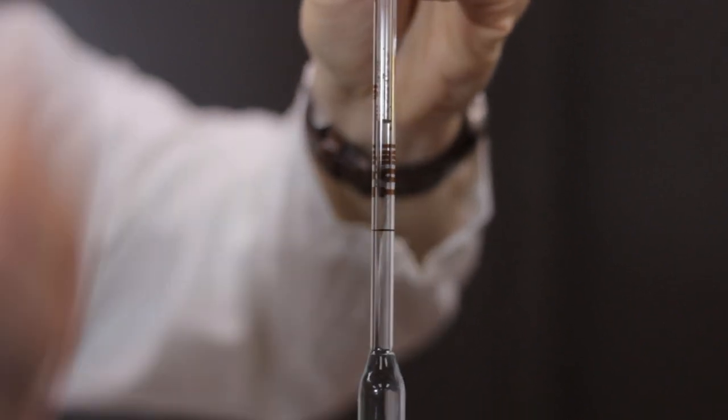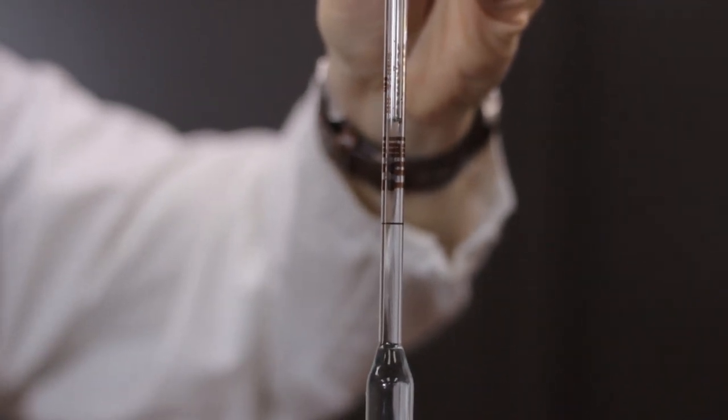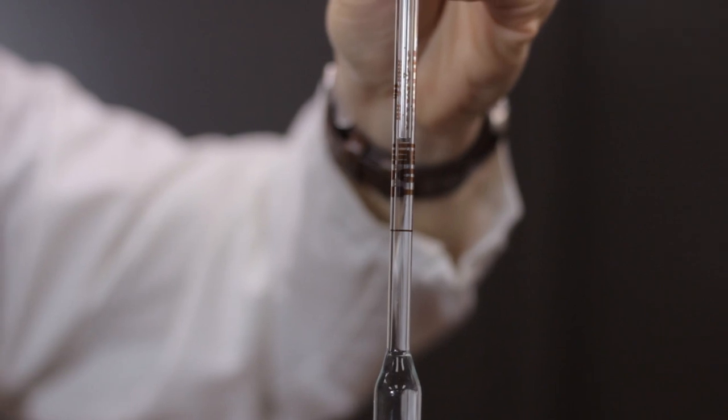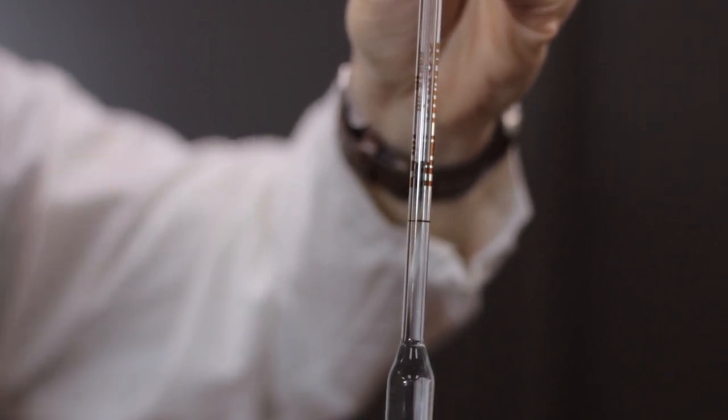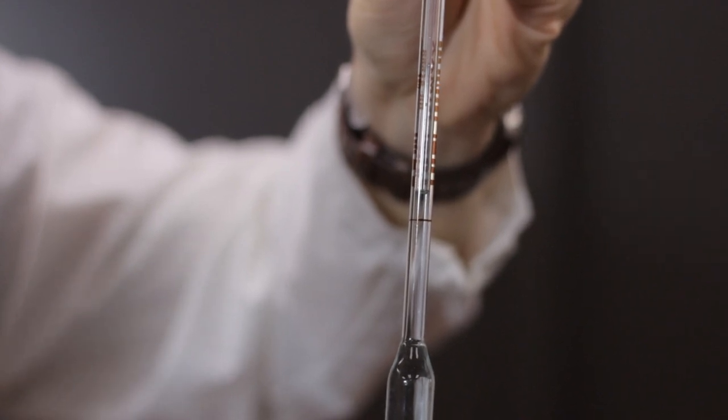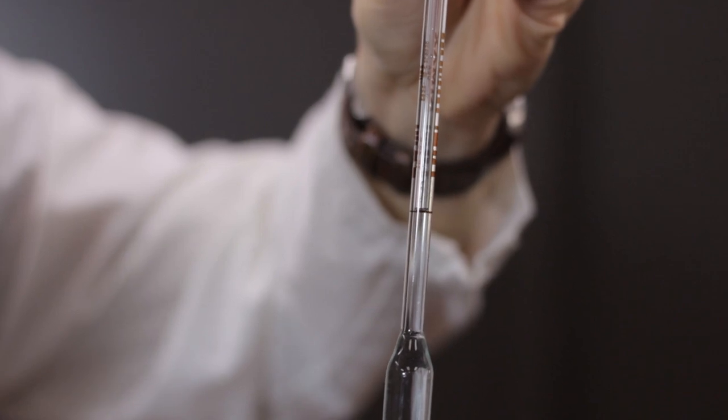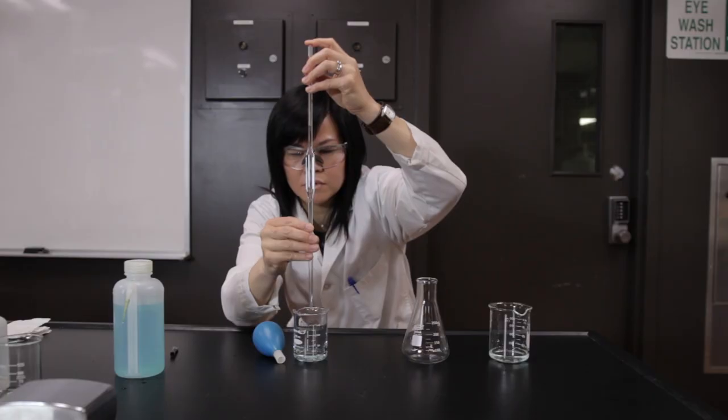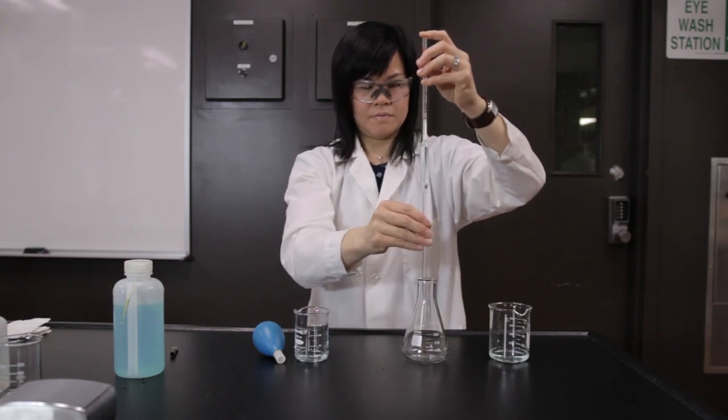Dip the pipette tip into the solution. Release the finger pressure slowly to allow the solution to drain until the bottom of the meniscus is at eye level. Touch the tip of the pipette to the beaker to remove any partially formed drops.